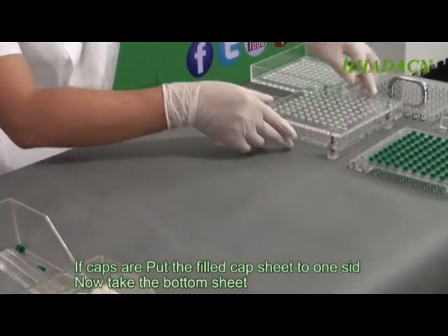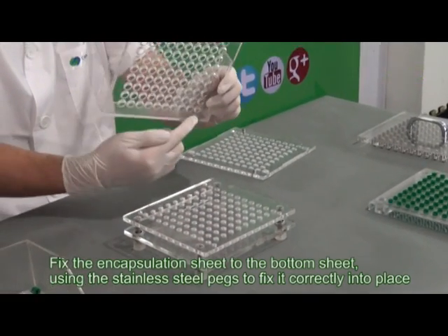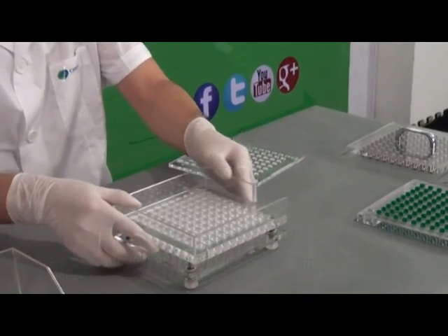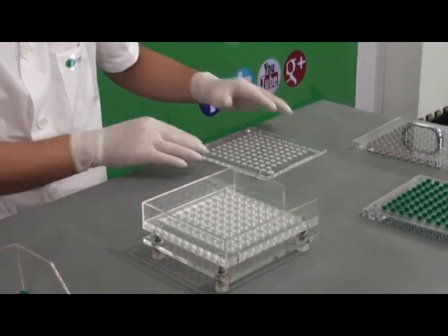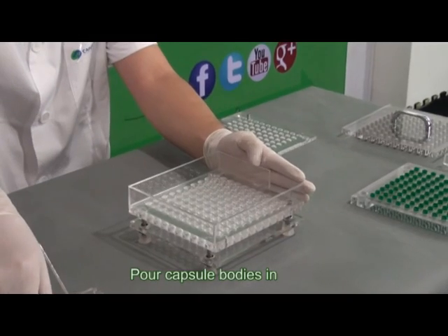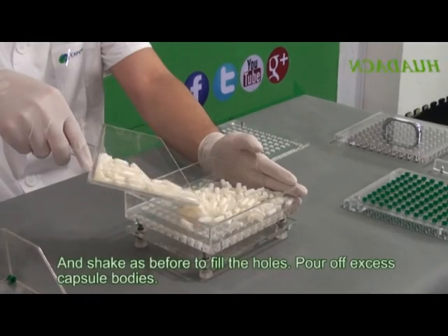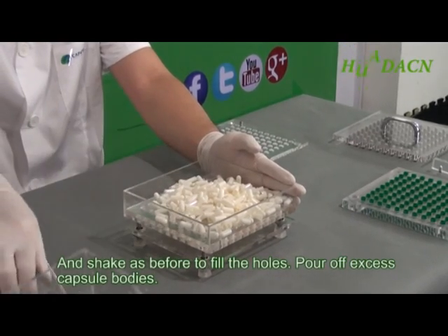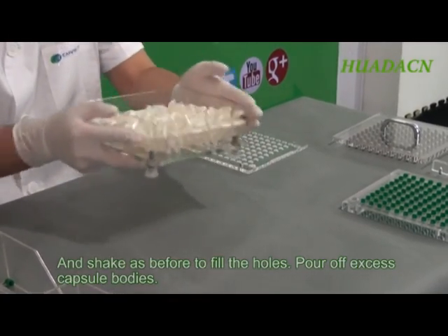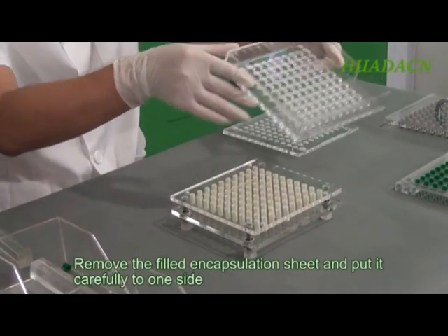Now take the bottom sheet. Fix the encapsulation sheet to the bottom sheet, using the stainless steel pegs to fix it correctly into place. Pour capsule bodies in and shake as before to fill the holes. Pour off excess bodies. Remove the filled encapsulation sheet and put it safely to one side.